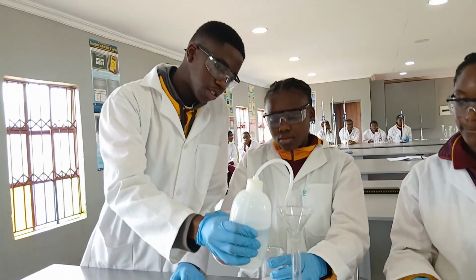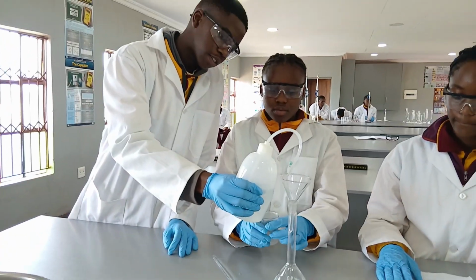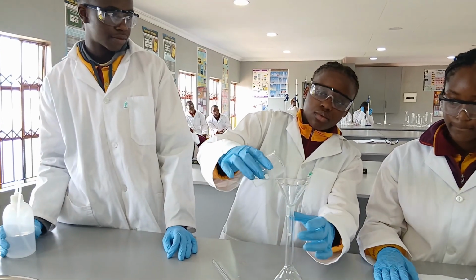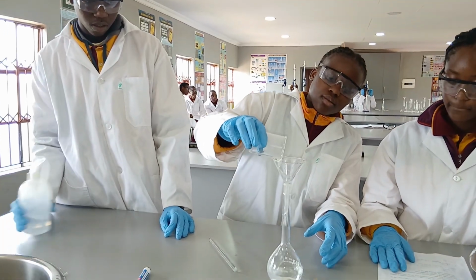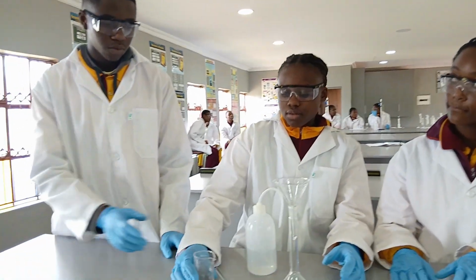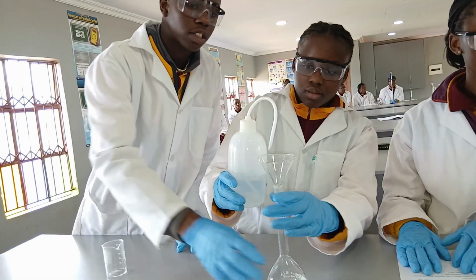After it has all dissolved, we add it into our volumetric flask. We add more distilled water until we reach our mark.